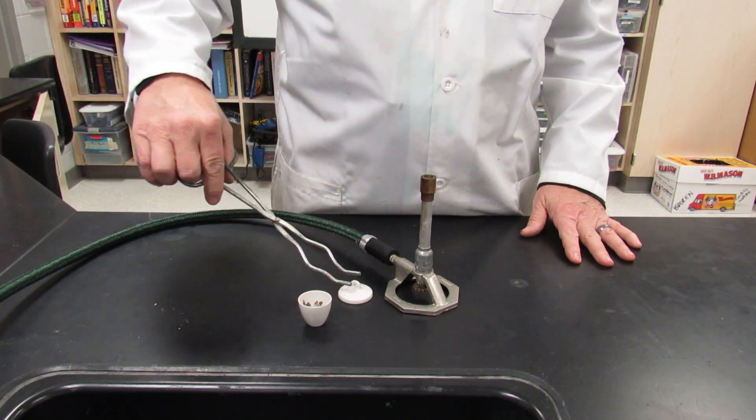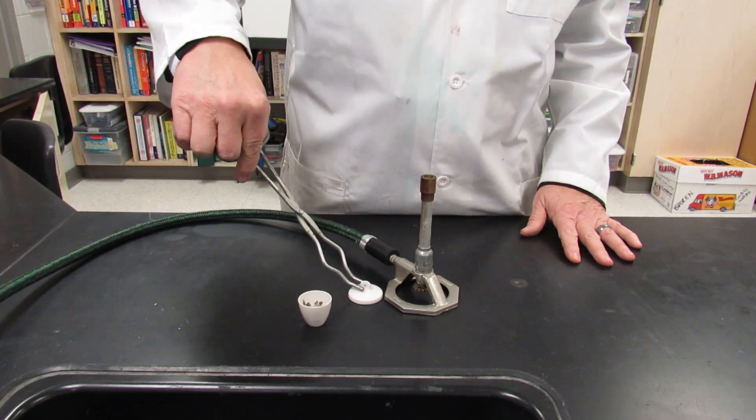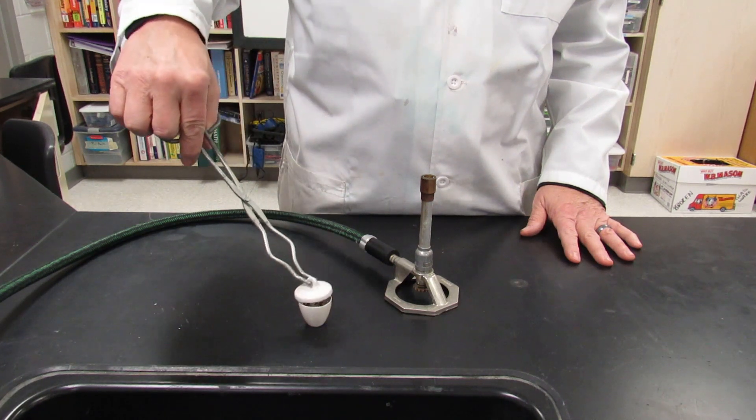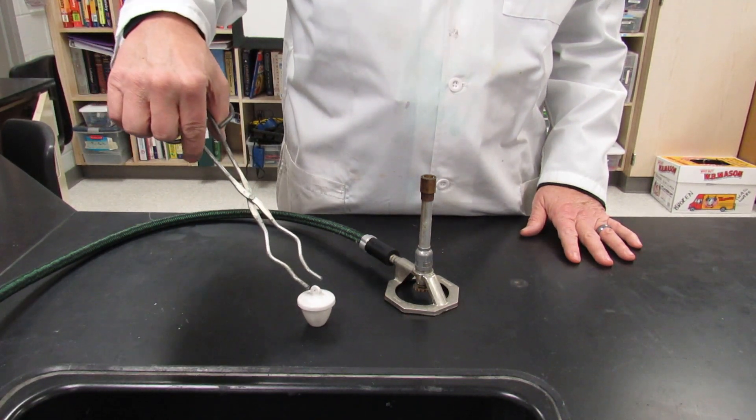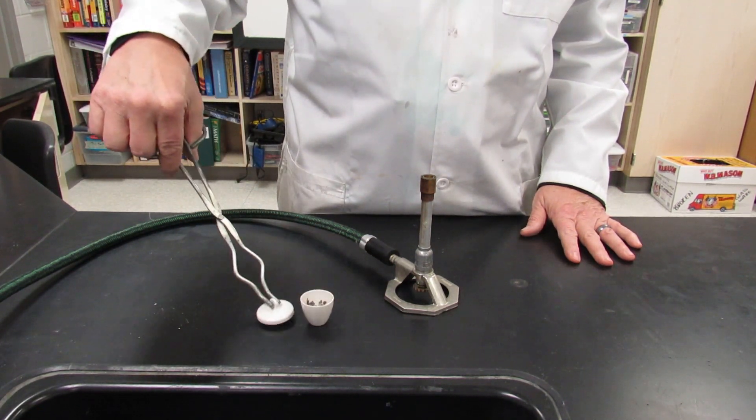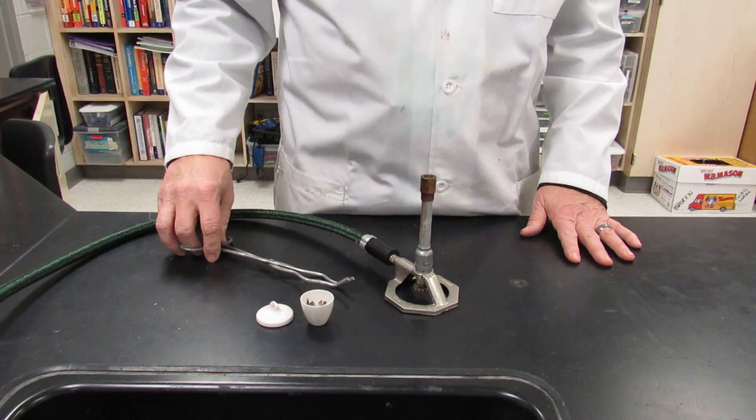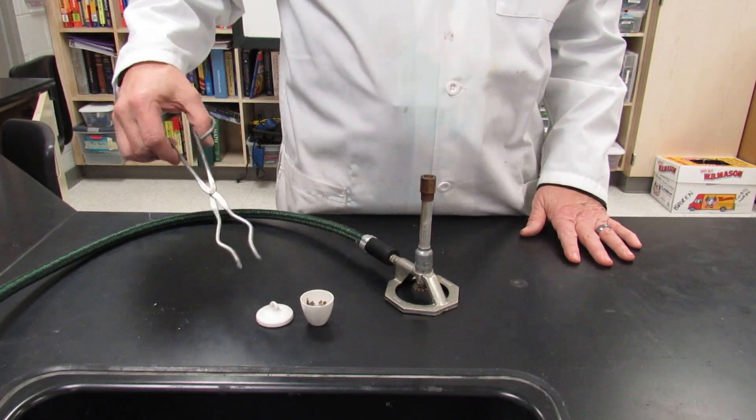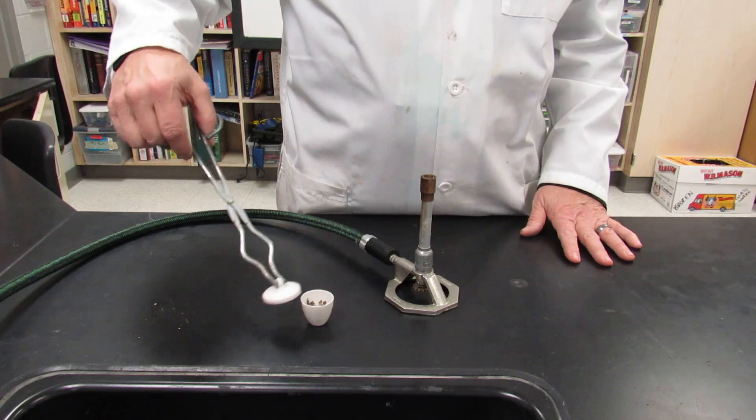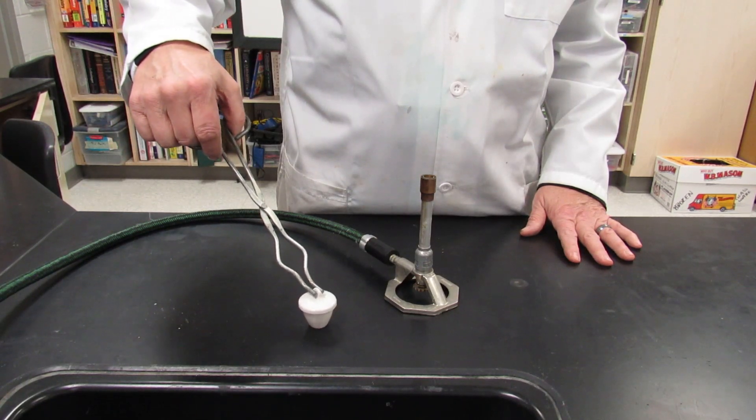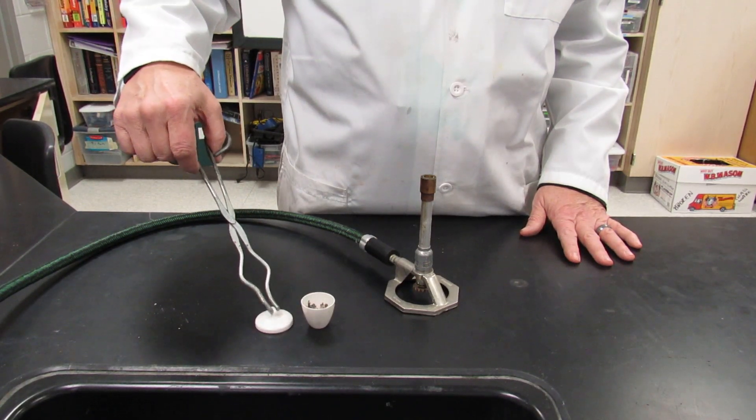You also need to be able to pick up the lid. If you can't pick it up with the curve in that orientation, you can always flip over the crucible tongs. But you need to be able to take the lid off, put it on, take it off, put it on.